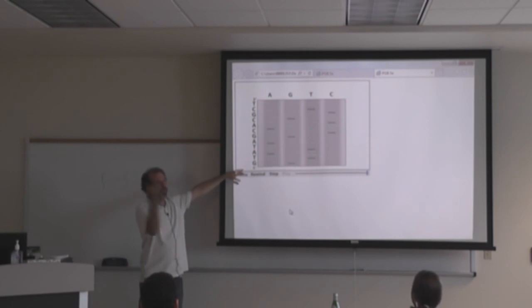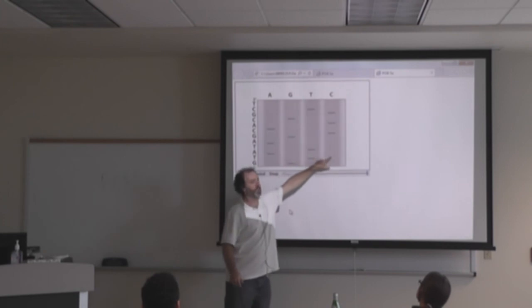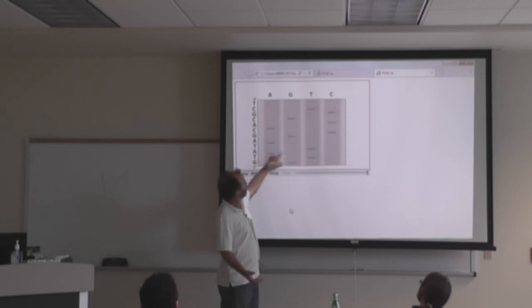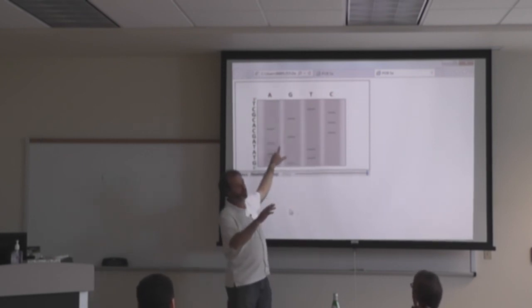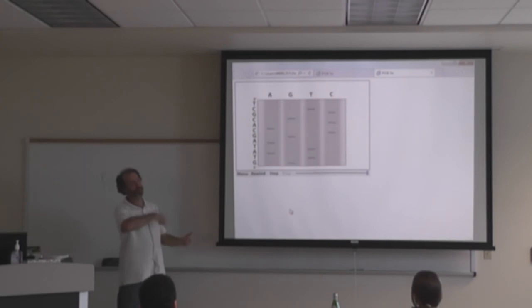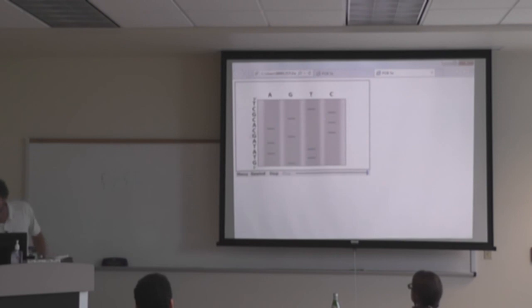What you're going to be doing, and anybody who's going to take Methods 2, is similar to this, but rather than having four reaction tubes and radio labels, we don't want radio labels here. We have one reaction tube, and you have four dideoxy fluorescent labeled nucleotides. They're labeled with a fluorescent label, a different color for each base. And then you run it through capillary electrophoresis and measure the fluorescence that comes off. So that's the original way they sequenced the genome too. So it's quite a slow process. But these days there are more modern methods.